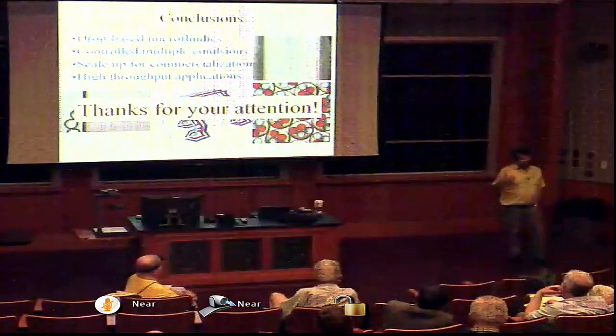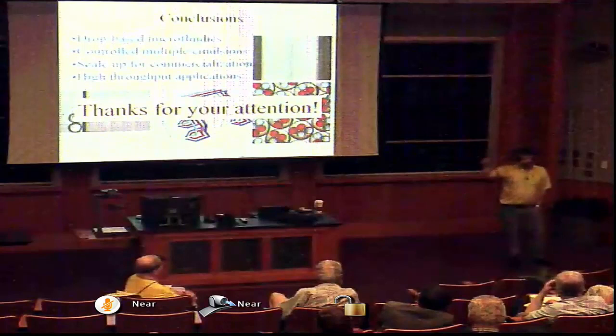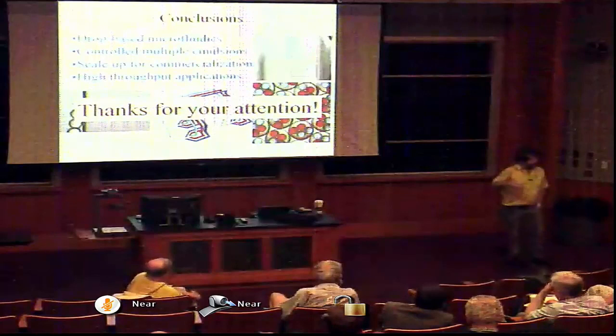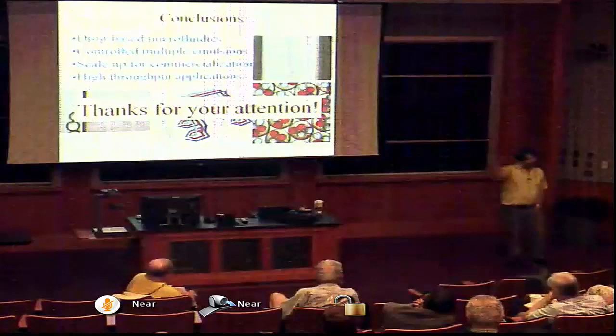We have other ways, using these kinds of techniques, I haven't described the details, to look for pathogens. If you want to detect sepsis, you have to detect one bacterium per mil of blood. We are now down to two bacteria per mil of blood. Very, very sensitive ways of doing it. We'll get down to one eventually. There are added steps you have to do to concentrate. You can't work with the mil. You have to work with 50 microliters. But there's a lot of technologies now that do the same thing. So you're absolutely right. It's the connection between the real world and the microfluidic world. You have to worry about it, but I think that's being solved.